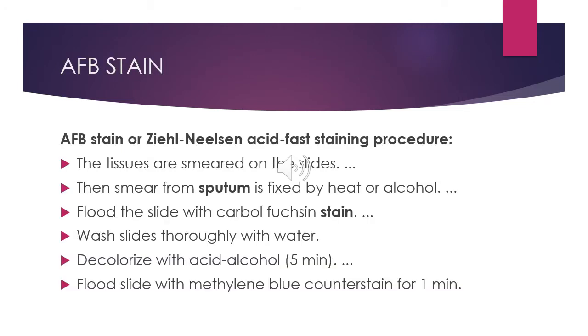Let's go to another differential stain or special stain, which is the acid-fast bacilli stain. Acid-fast staining, the Ziehl-Neelsen or Kinyoun stain, is done to stain or identify acid-fast bacilli. Acid-fast bacilli require a special technique as their cell wall is composed of mycolic acid.